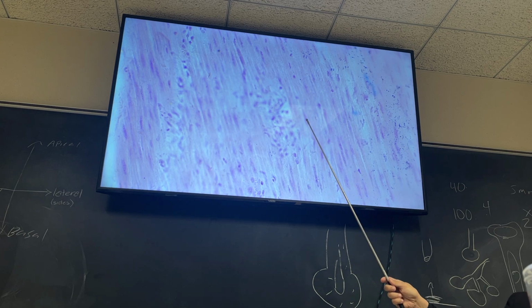And you can see these fibers, if you look close, you zoom in and out, you can see these little fibers that go about that far, and that's about all there is to them. And where are the nuclei? They're in the middle of them. So the nuclei are just everywhere. They're not pushed anywhere. They're in the middle of the tissue, and in the middle of the fibers, shall we say. And the fibers are all these little things about this long. They're not very big. So that's the longitudinal cut.